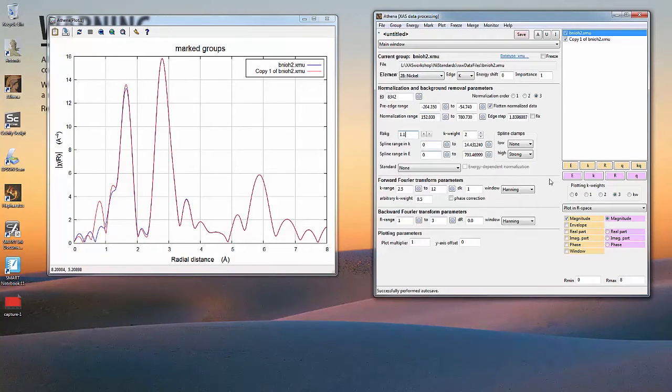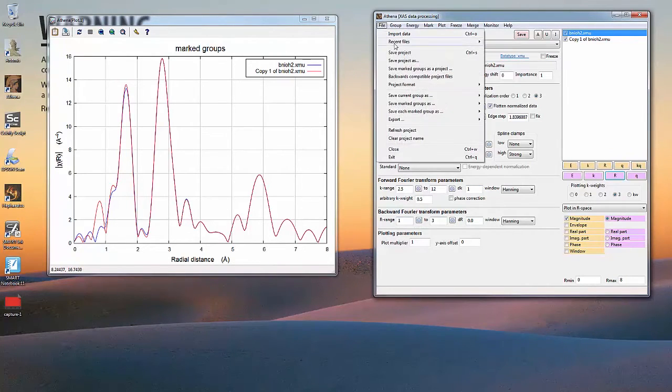What happens when we go up even more? You can see we start to get some artifacts. So I'm going to just leave it at that and say 1 is the ideal R background value for this sample. I'm going to go ahead and save this project.